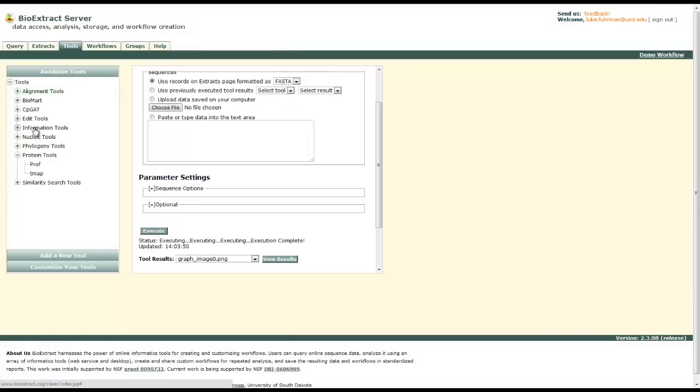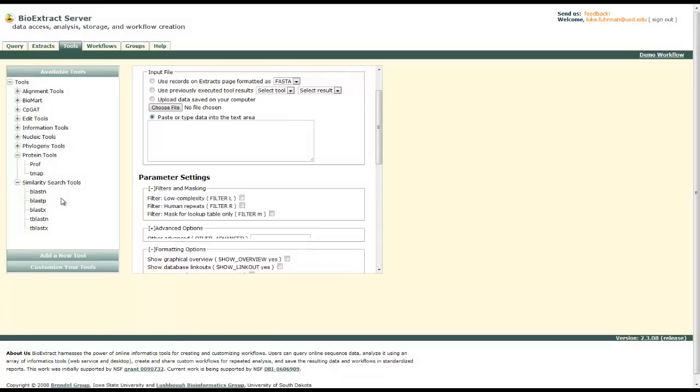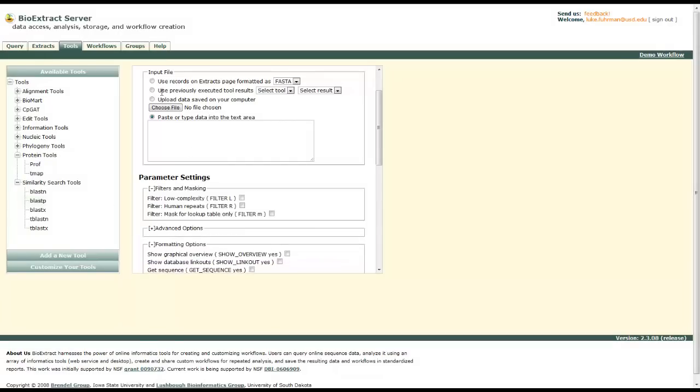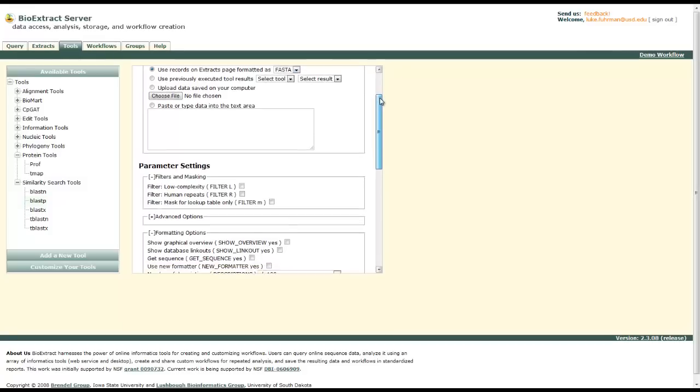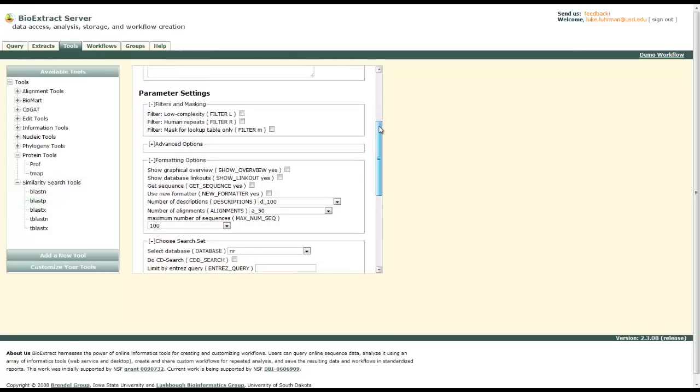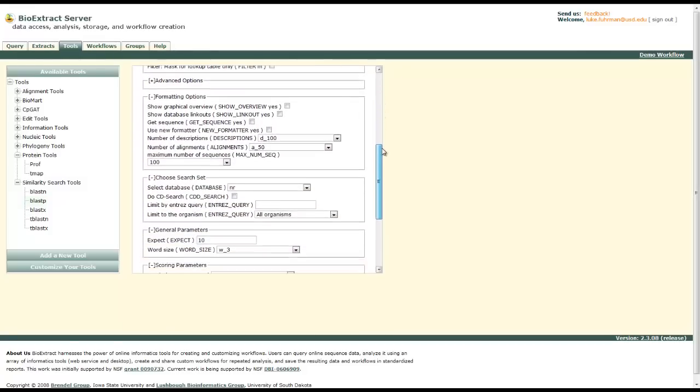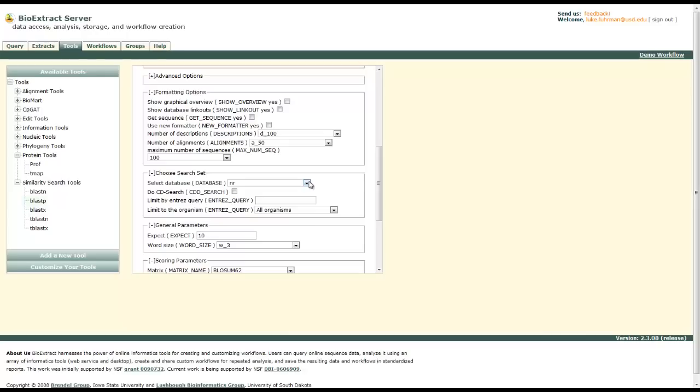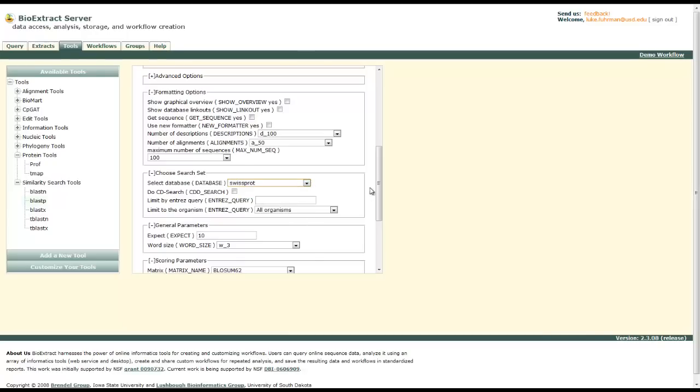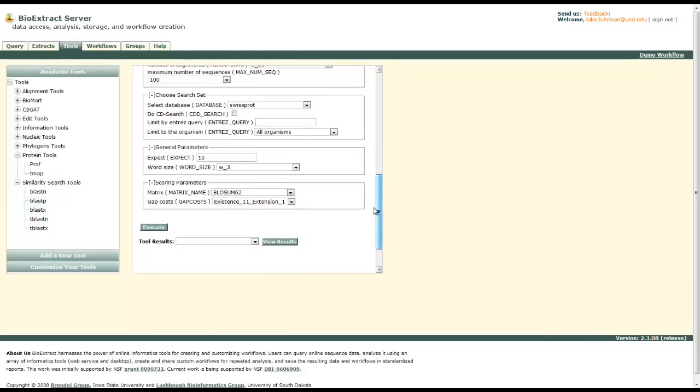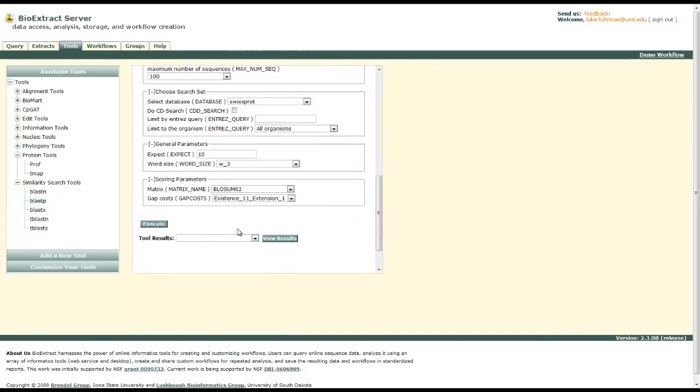Go to similarity search tools and BLASTP. Make sure that extracts in FASTA format is selected. Then we're going to select only from the Swiss protein databank. And then you can execute the tool.